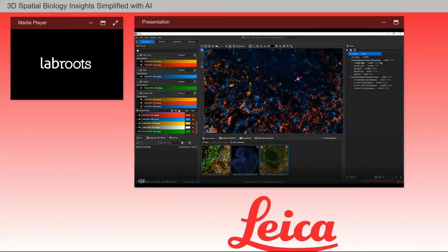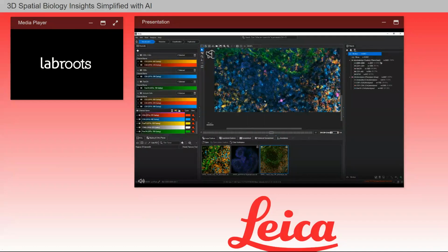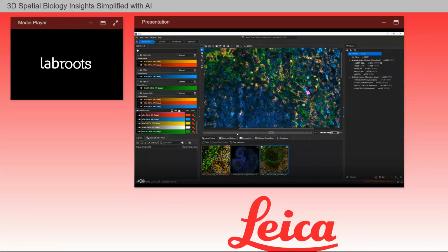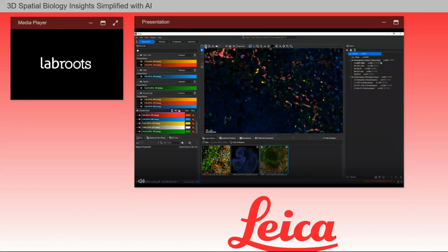And when I go into the 2D view, Aivia will sync the 2D view to the current XY position and Z plane specified in the 3D view. I can do the same in 2D, panning to a different location in XY and navigating to a different Z-plane. And when I switch to 3D view, my 3D rendering will sync to my current position in the 2D view.